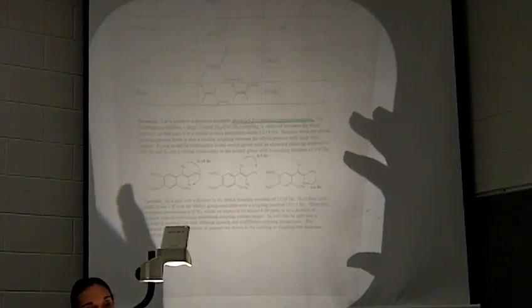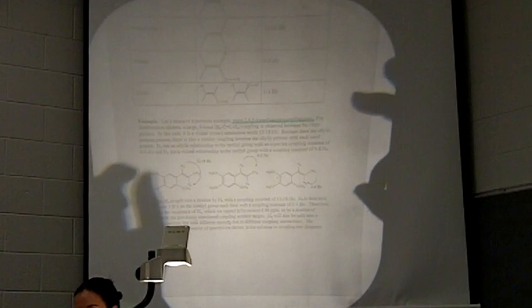Okay, I am going to go through the example that is in your lab manual, how they came up with proposing splitting trees, which is your proposal of what the coupling constants and the splitting are going to look like based on what nearest neighbors are involved in that compound, either aromatic or across a double bond.